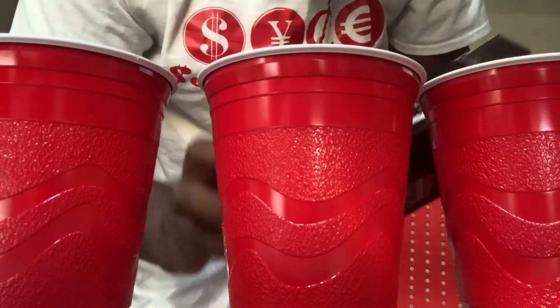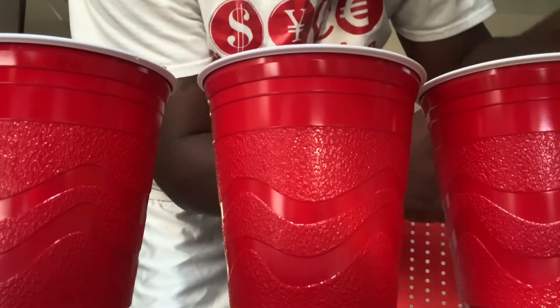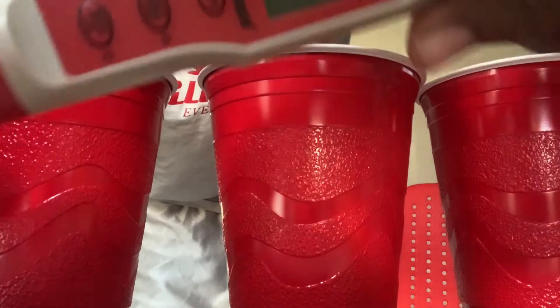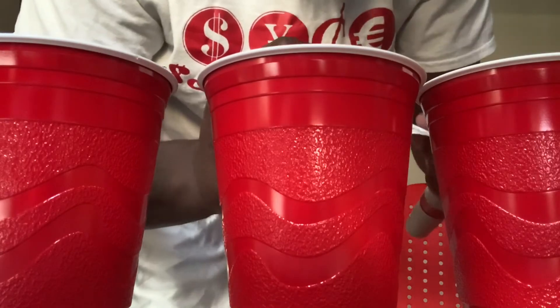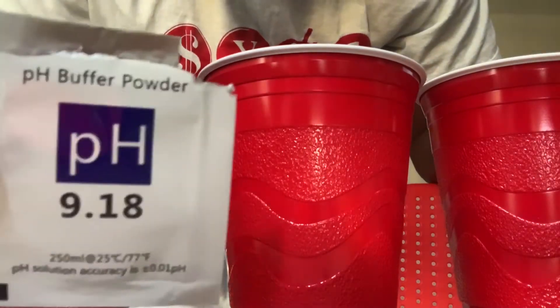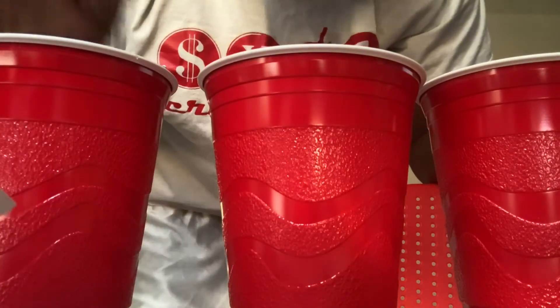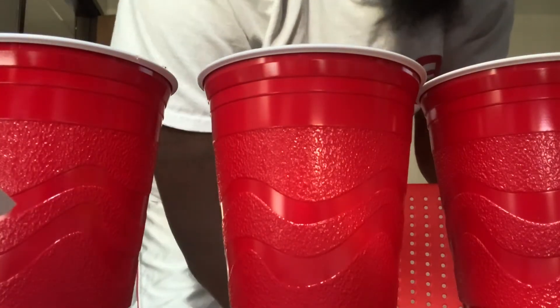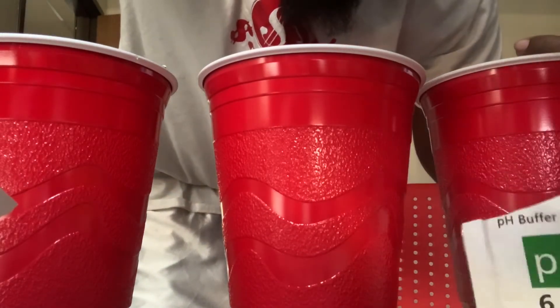Take it out of the package. So what we've done here, they send the powder calibration — this will be for the middle one. We have the 9.18 for this side and the 6.86 for this side.